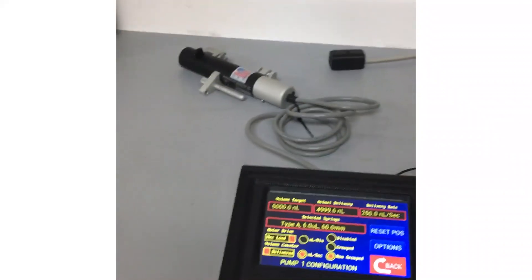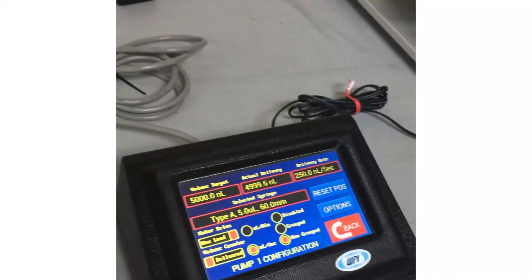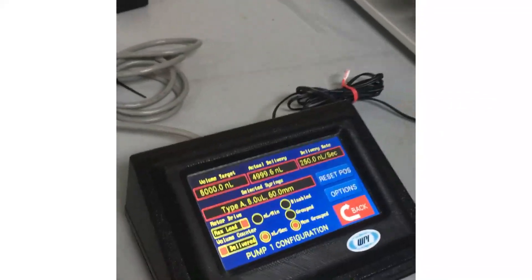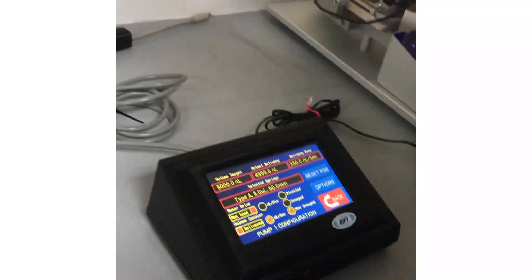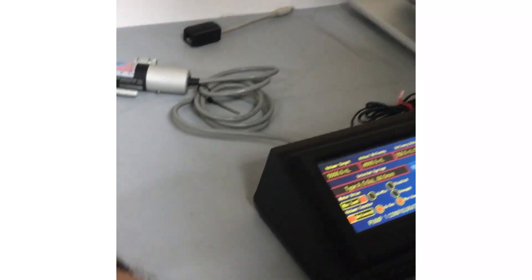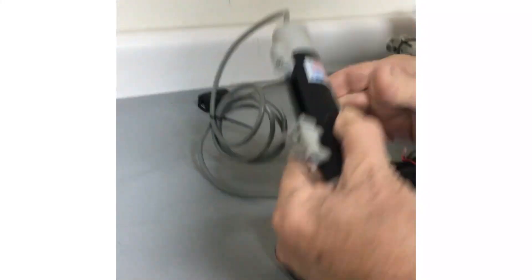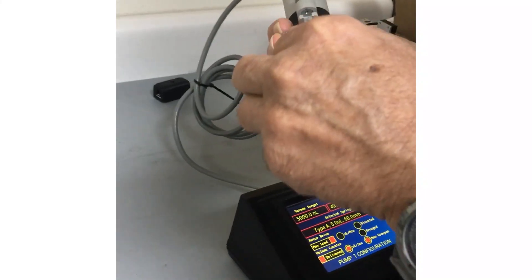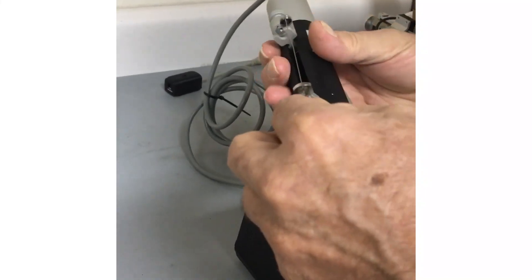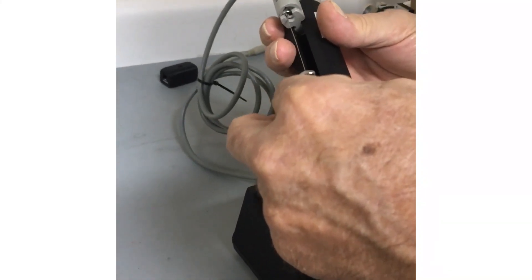In this particular case, a 10 microliter syringe. The easiest one to deal with is our nanofill syringe because we sell a lot of them, so that's a common syringe.